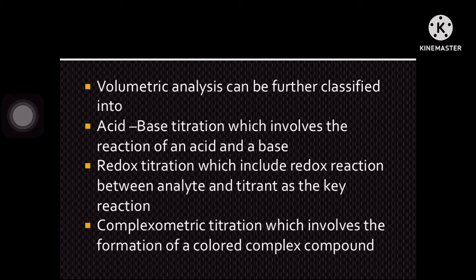Volumetric analysis can be further classified into acid-base titration, redox titration, and complexometric titration.